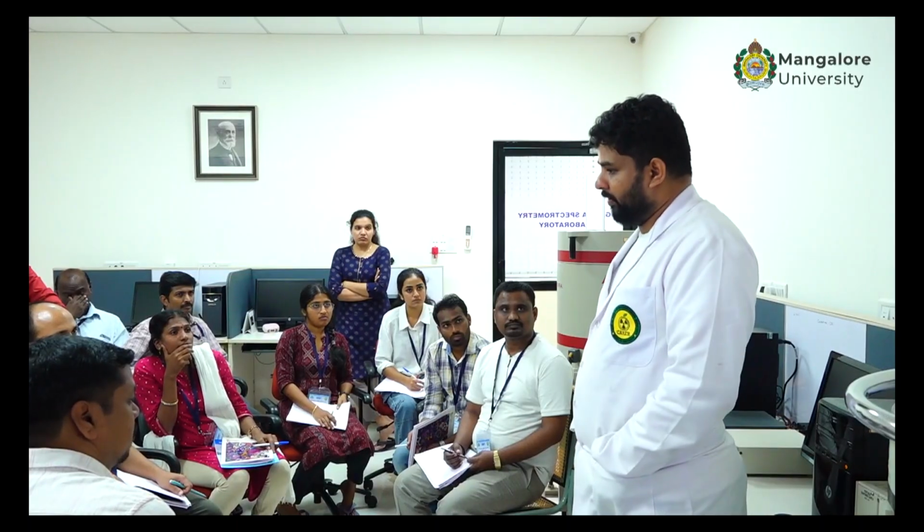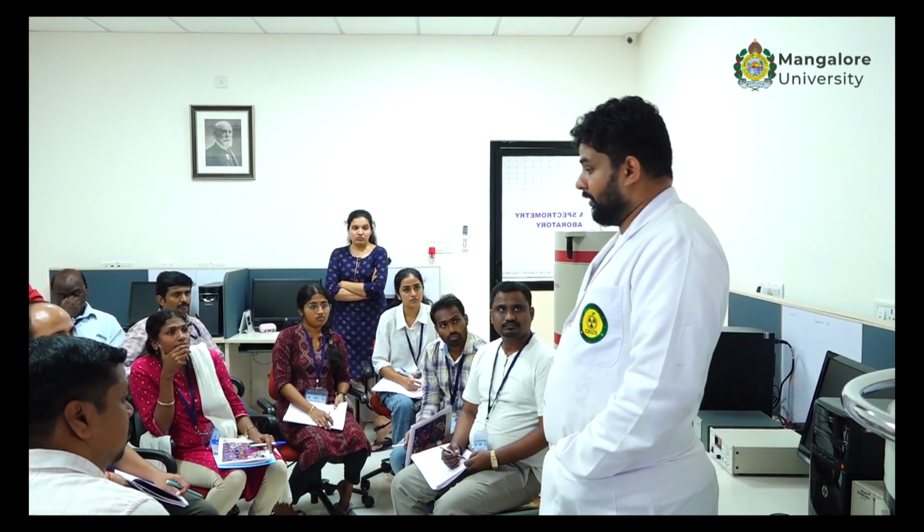We are happy to say that we have got all our results as acceptable, and that has been the case for the last 10 or 15 years. For the last 5 years I have been doing it, and we were able to get acceptable results. So we will also give you that sample, and we will show you how the format is, how the results come, how they give us samples, and how we have to analyze it.